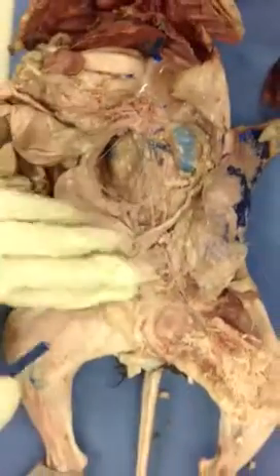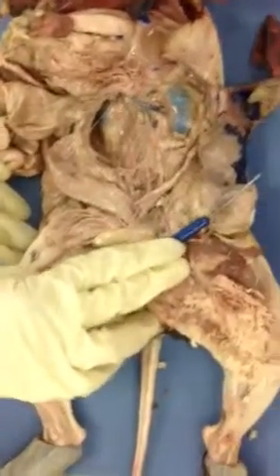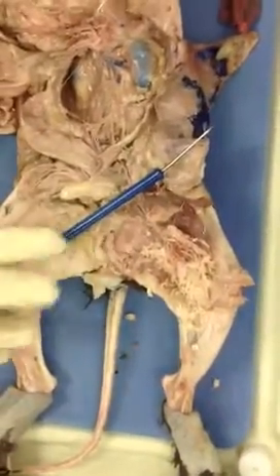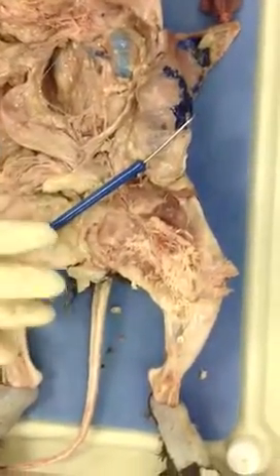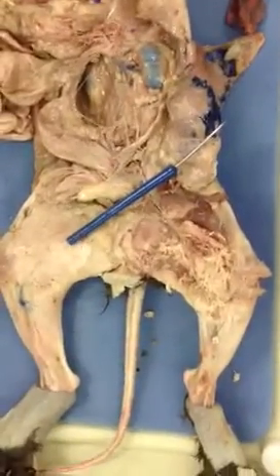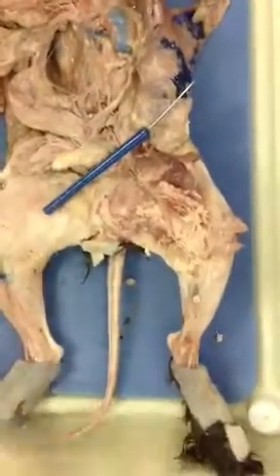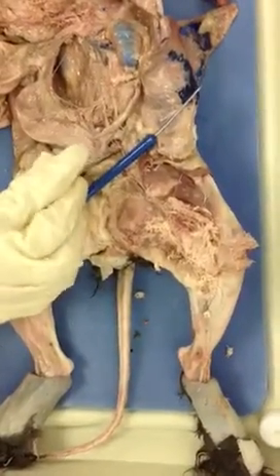Very good. Now, I'm going to draw another imaginary line so I could differentiate where the inguinal canal is, or inguinal, right? What we call the name in terms of groin. Now I know that this imaginary line from here to here is called iliac.